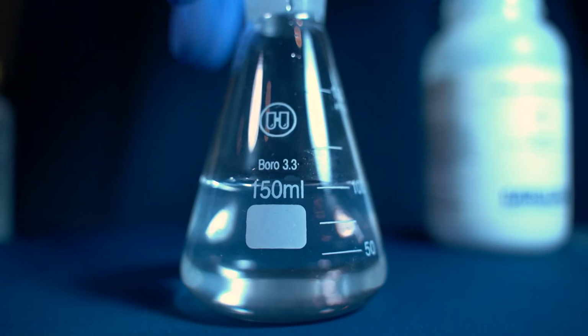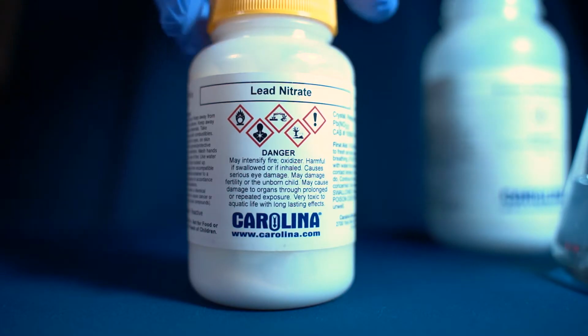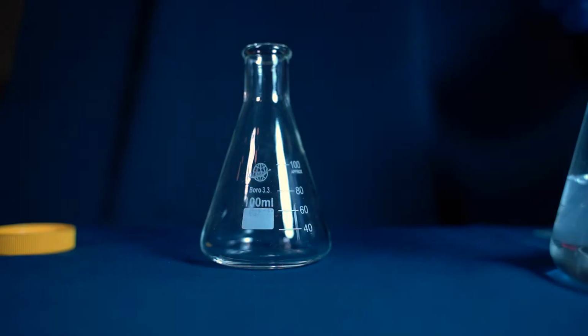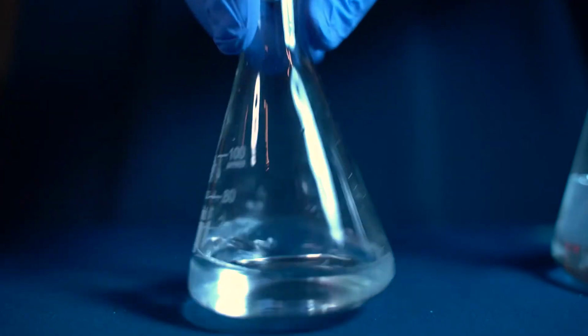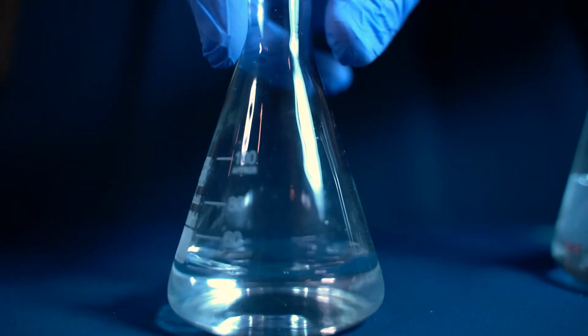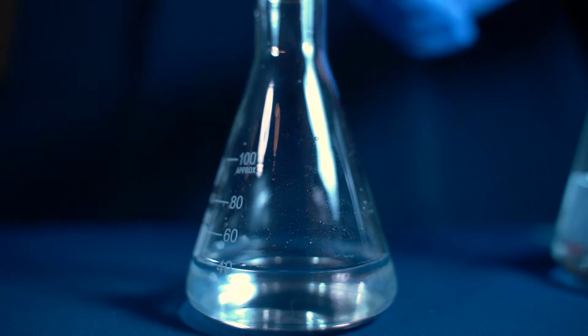So there's our sodium sulfate solution. Now we're going to make our lead nitrate solution. Water in it. Looks like that's all dissolved. So there's our lead nitrate solution. Now what we're going to do is combine them and see the precipitate that forms.